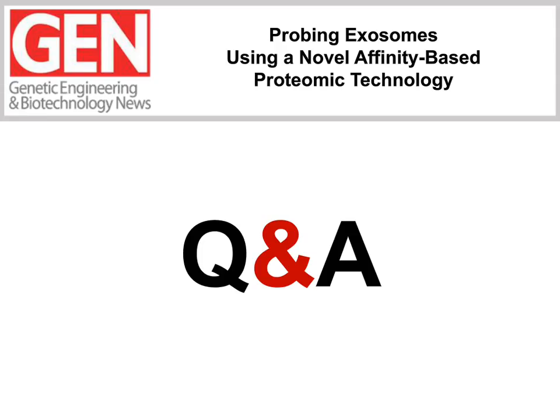Thank you. And Steve, we have another question very closely related to that. I don't know if you want to add anything to it. Do you have the ability to distinguish between post-translationally modified forms of proteins or splice variants?